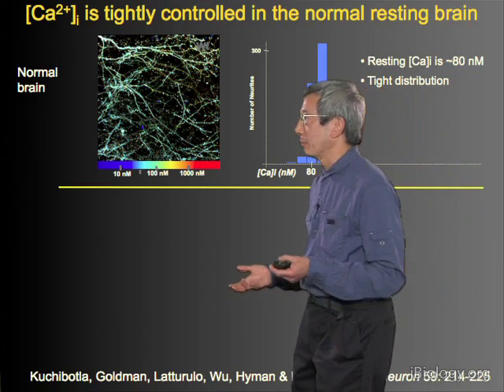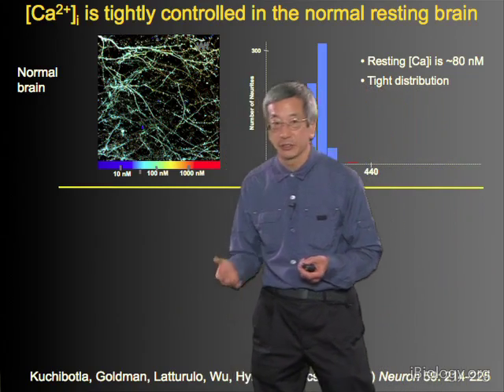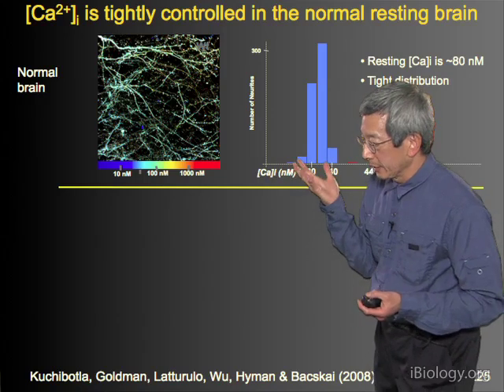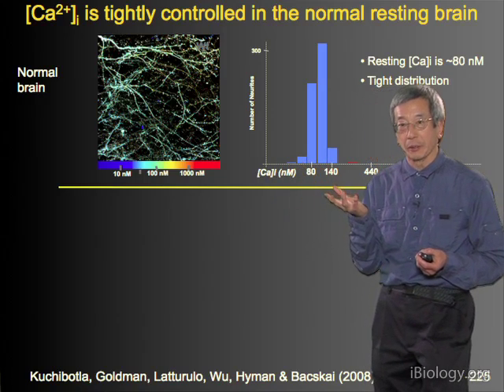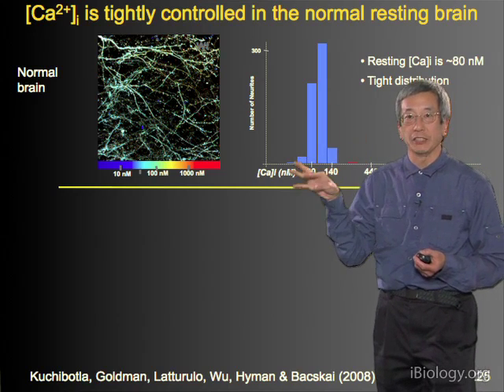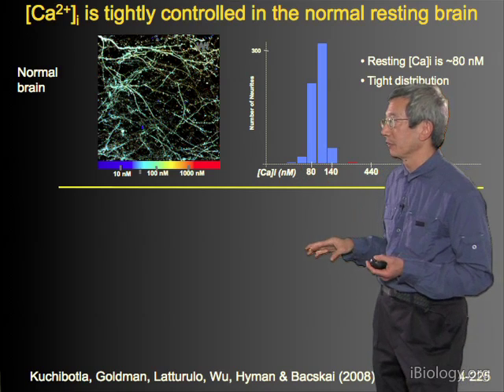As another example of the biological usefulness of the chameleons, and particularly here it was useful to have a ratiometric indicator that changed color, which made it possible to try to calibrate the actual yellow to cyan ratio in terms of an absolute calcium level.